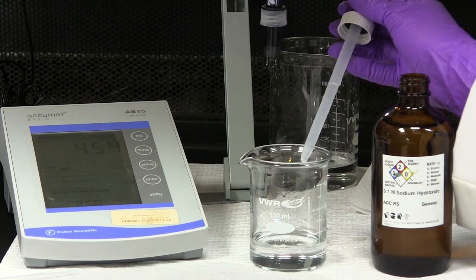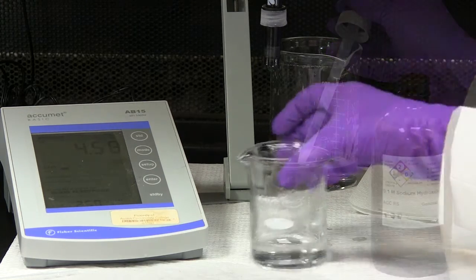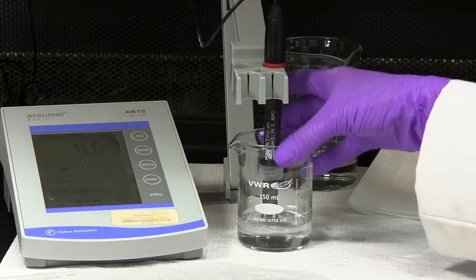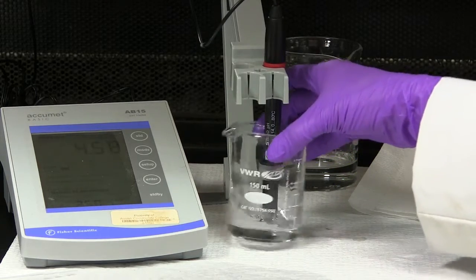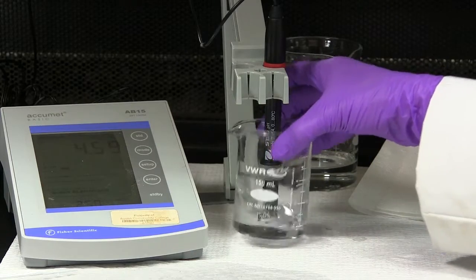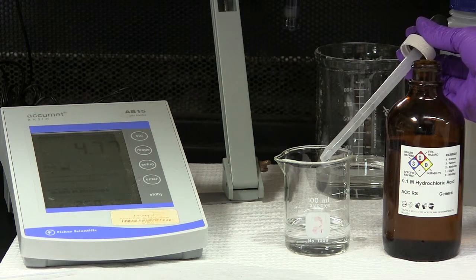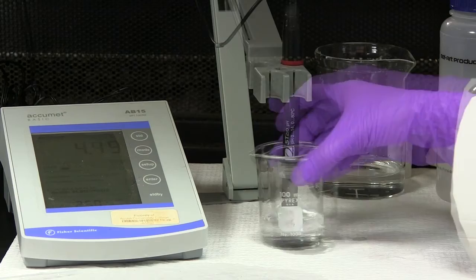Add 5 drops of 0.1 molar sodium hydroxide to the diluted buffer and measure the pH again. To the other half of the diluted buffer, add 5 drops of 0.1 molar hydrochloric acid and again measure the pH.